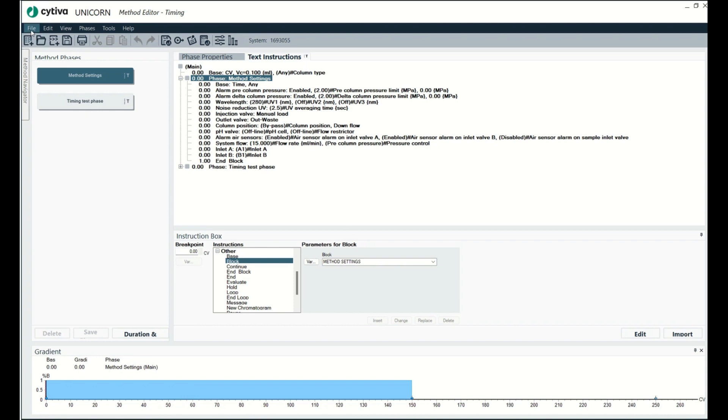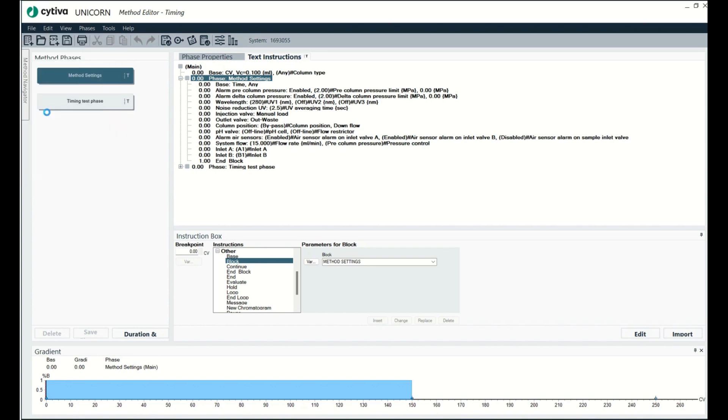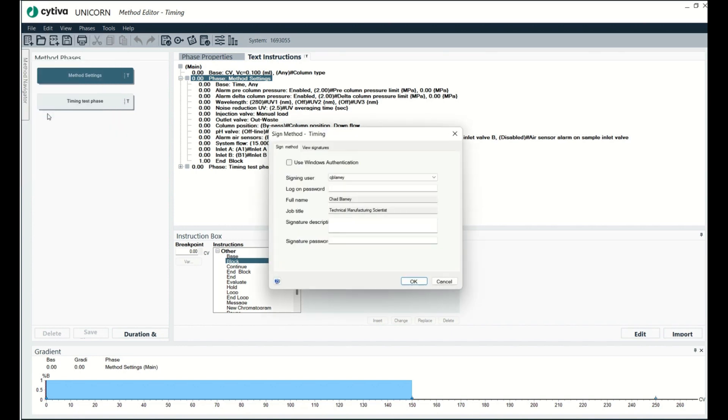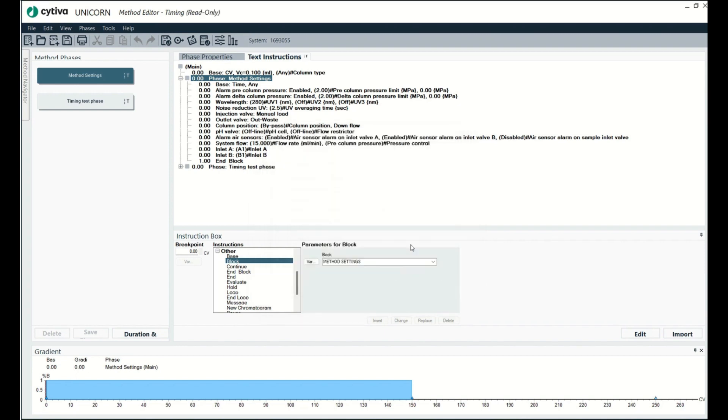Okay, so I'm going to go to file up here, right? And then I'm going to go to sign method. So I'm just going to type in my password and then a quick description and then my signature. Okay.